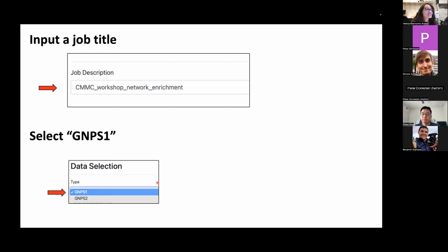Are there any questions? Everyone is following? Good. Yeah, there is a question. What is the difference between GNPS 1 and 2? I was sure that someone was going to ask that. I know that some of you might be a bit confused. Yeah, I already had a GNPS 1 account. Why are you creating another account for me?